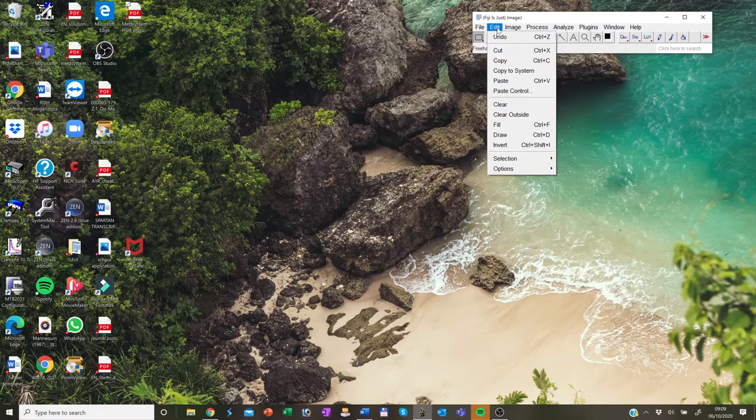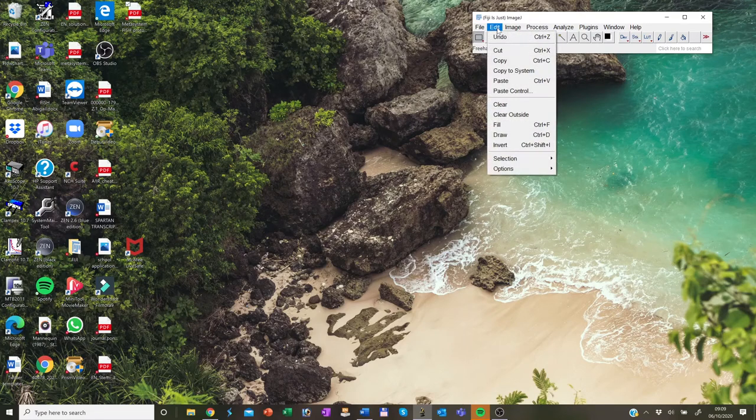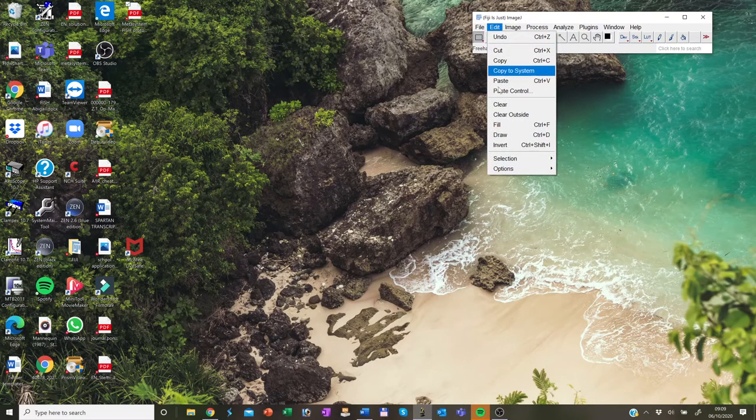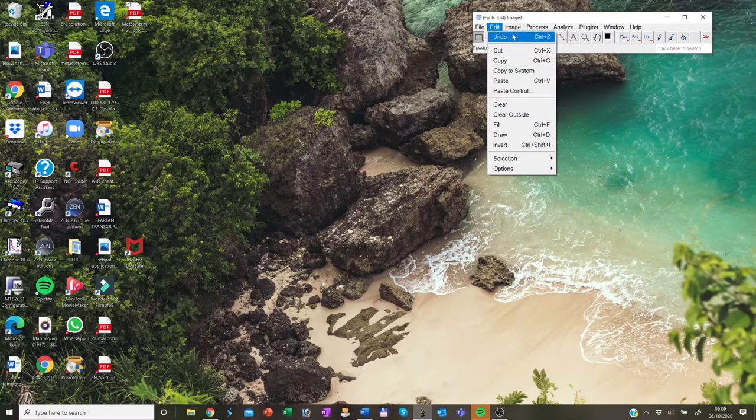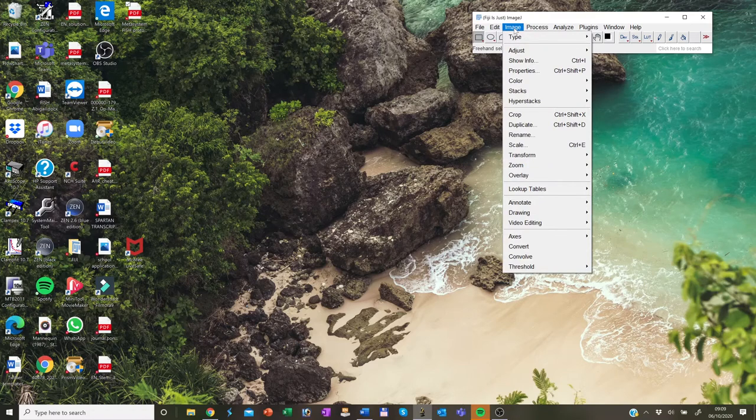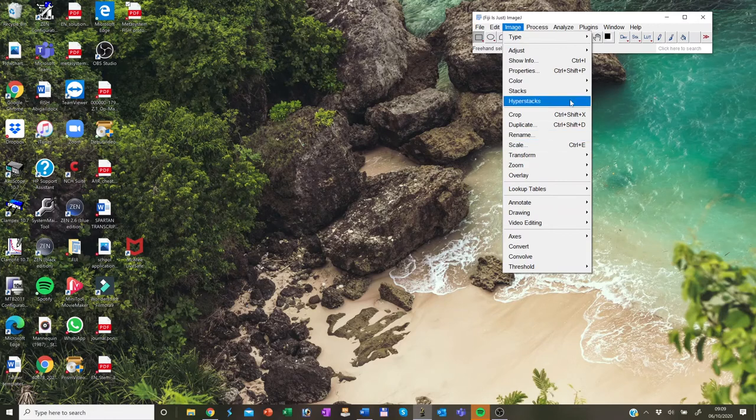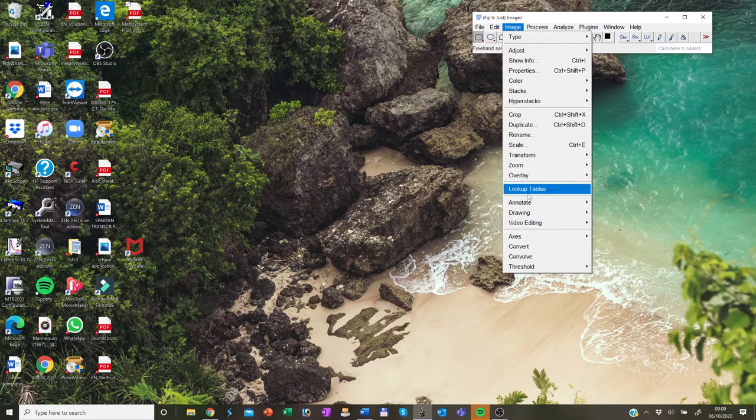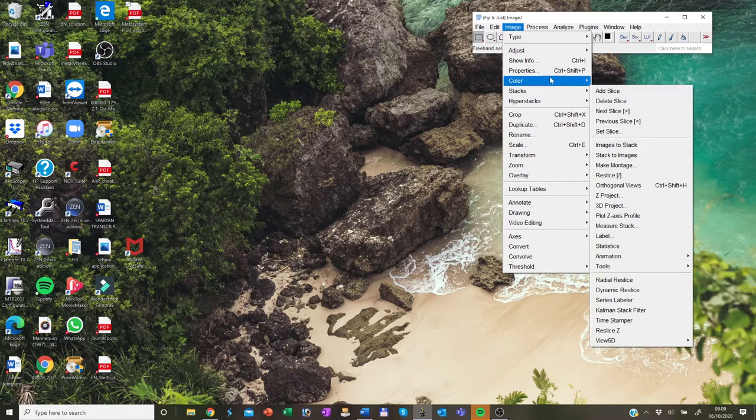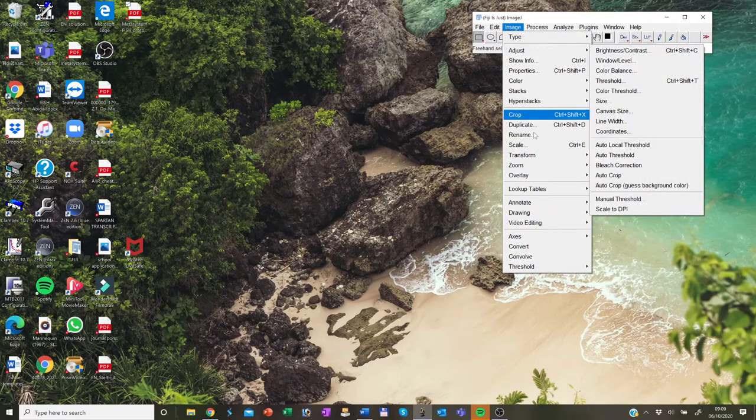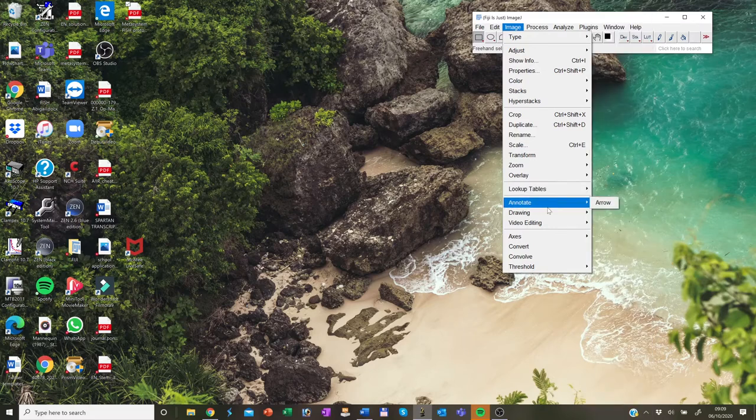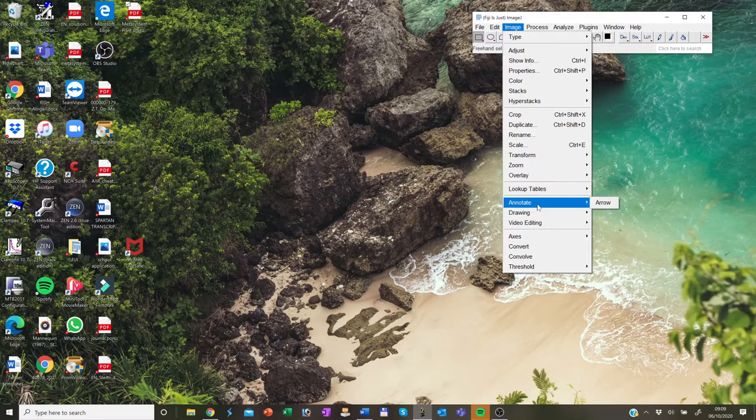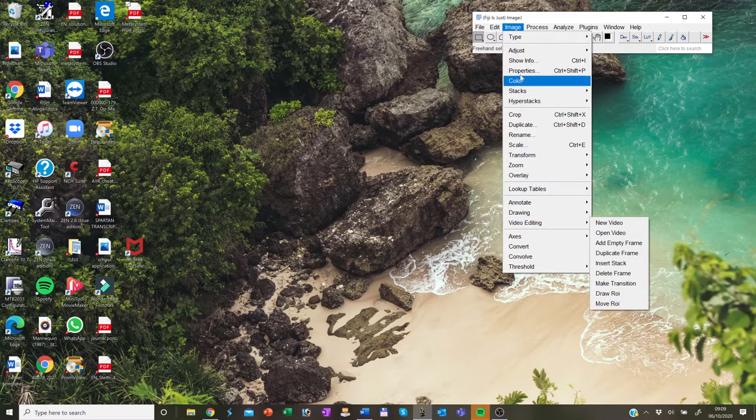The next section is edit. In the edit section, you will find all the selections and the region of interest handling. In the third bar is the image. Within this image, you find all the visualization and stack manipulation buttons. Also, how to adjust the brightness, the threshold, lookup tables. Also, it allows you to annotate, draw or edit your videos.